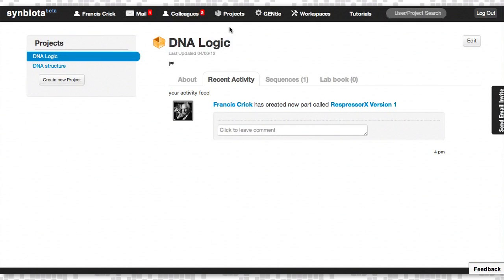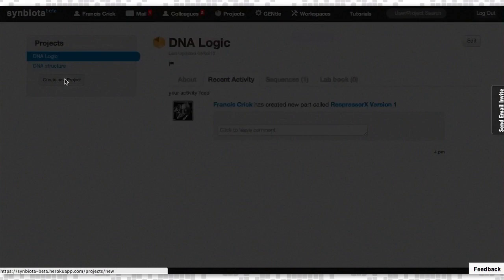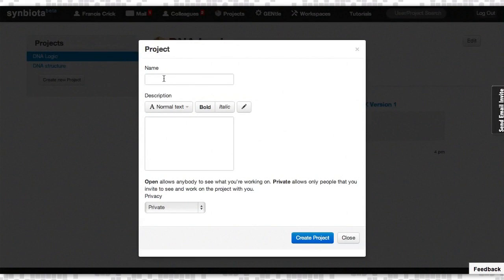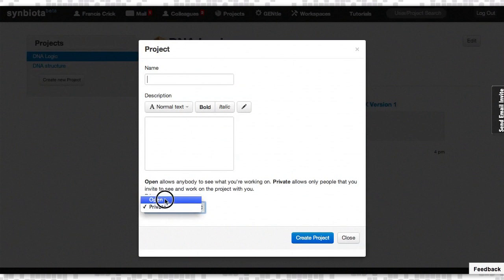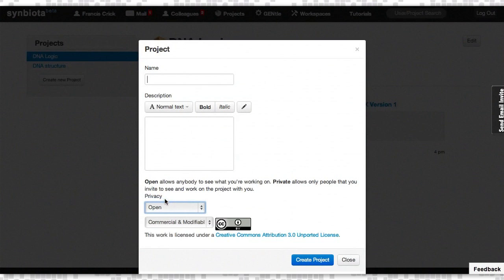Projects is a container for all of your information. You can create a new project, enter a name, a description, and choose whether the project is private, meaning only you and your collaborators can view and edit it, or whether it's open and discoverable by the entire Synbiota community.